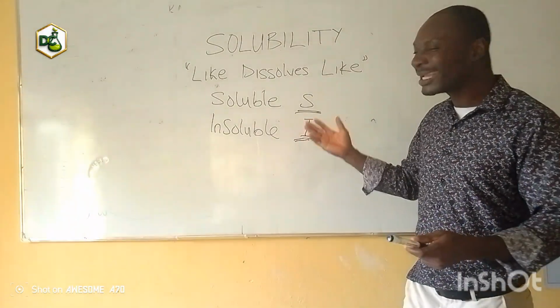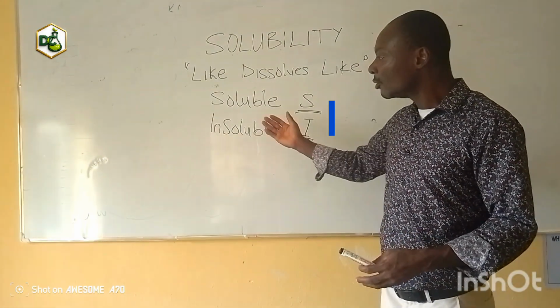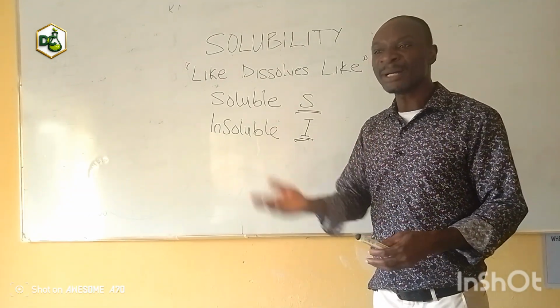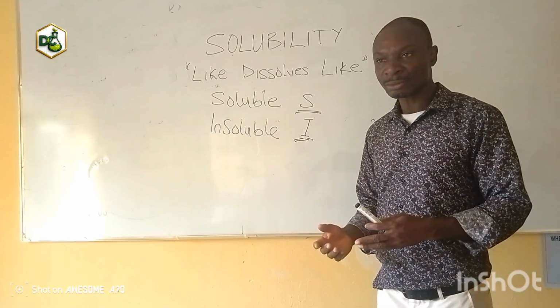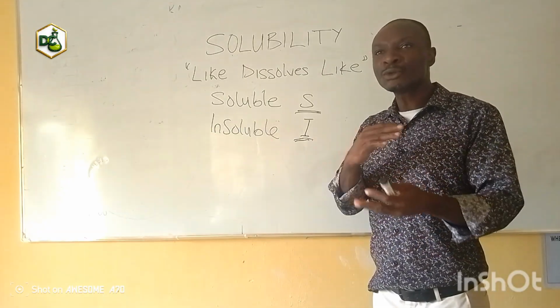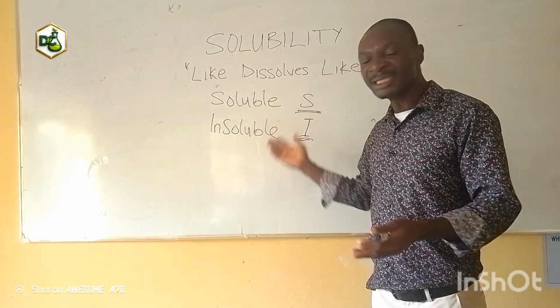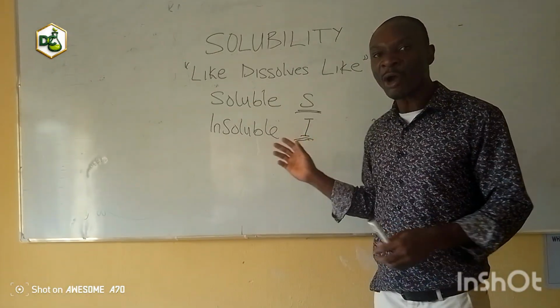Now, there are cases, which I have demonstrated, where when the solute is added to the solvent, you no longer see the particles in solid liquid interaction, and it appears as if it has dissolved, but the solution becomes milky or cloudy. It's not clear, like when we judge the case of when it is soluble, where a true solution is found.